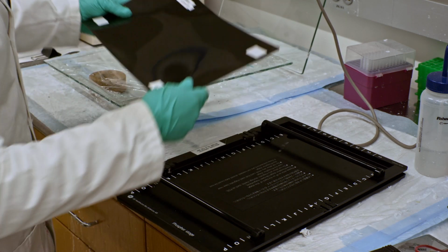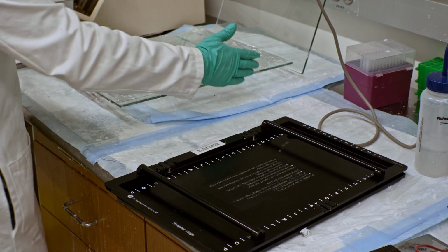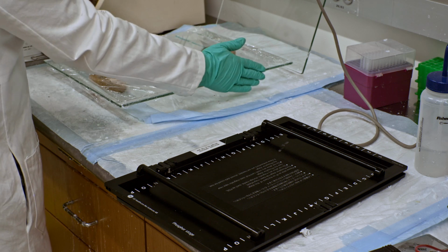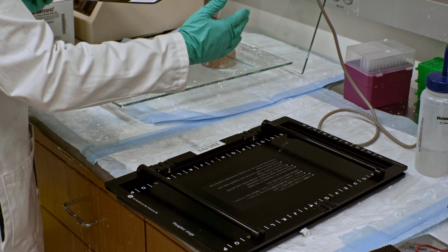As you may notice, this side on the right is our first sample that was labeled 1. Whenever you go to image this gel, you'll see that your results will look backwards, but don't worry, we have some software that will reflip the image in order for you to see your results the correct way.